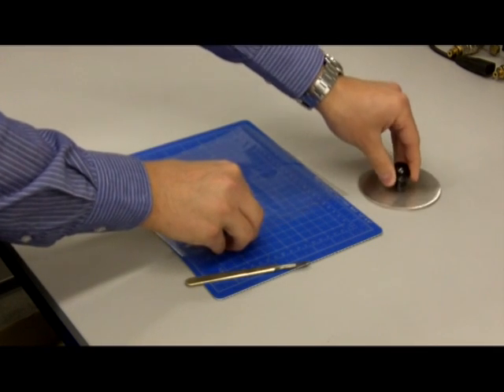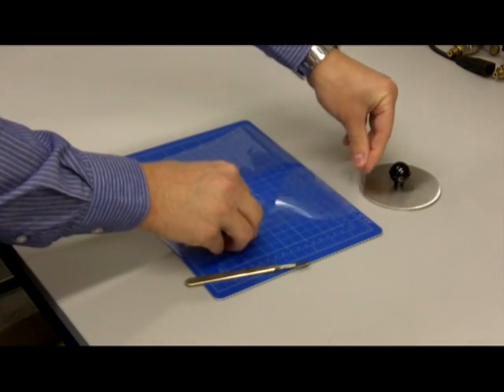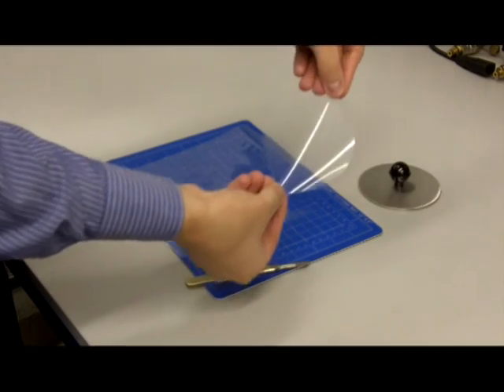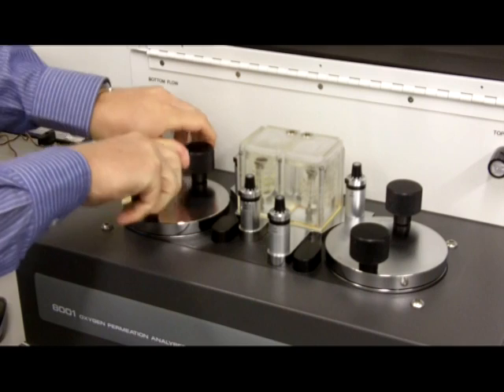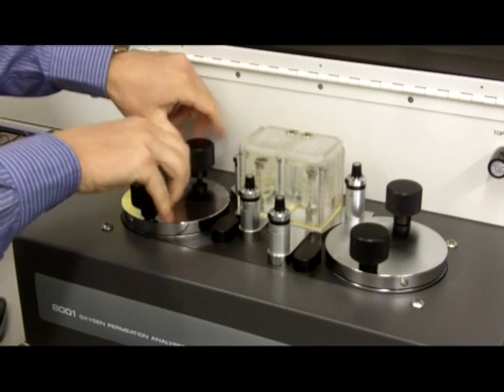Now the sample is ready to place on the instrument for testing. Now that we have the film sample, we next remove the chamber lid.